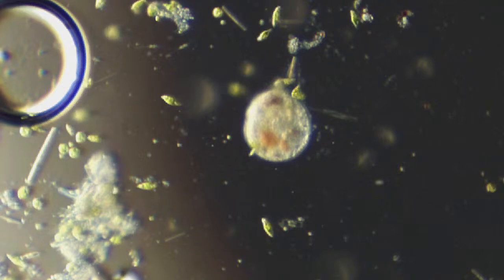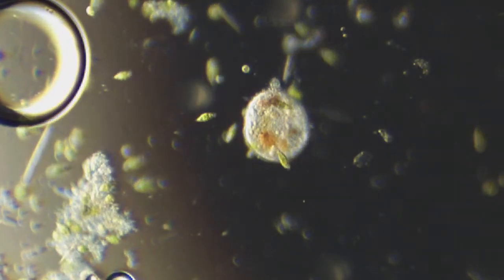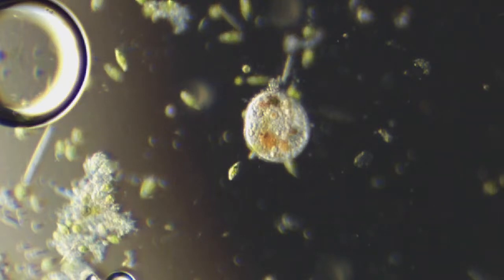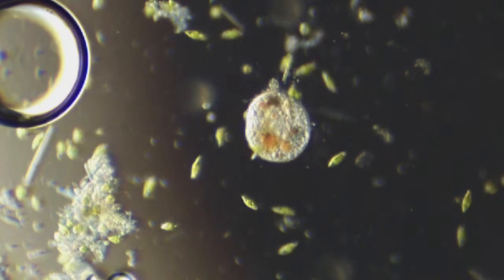So see, I have to focus. The Euglena are actually above it. I have to focus on them, and then that gets out of focus. Now I'm back in focus there. But Euglena are fun. They look like little ghosts. They have this little tapered body like ghosts in video games and stuff. The little green ghosts.